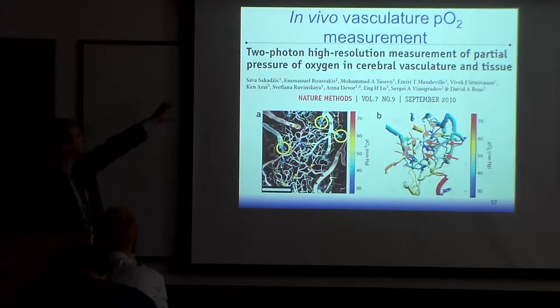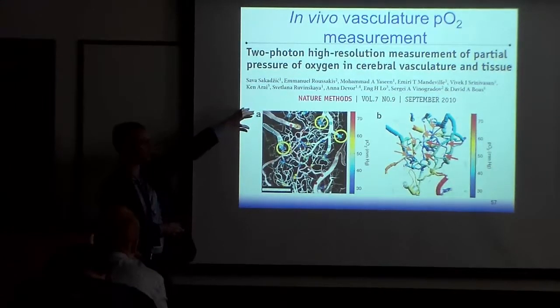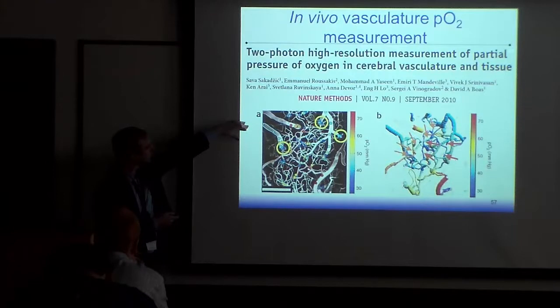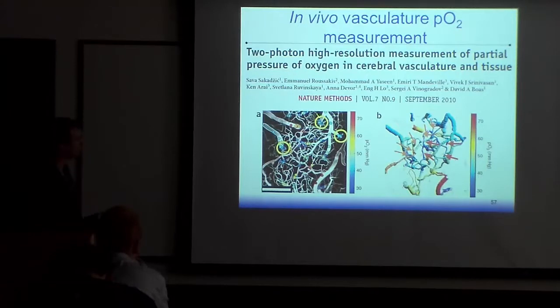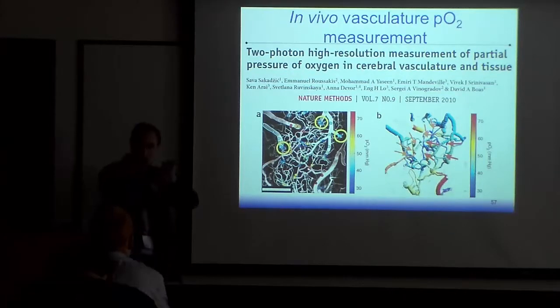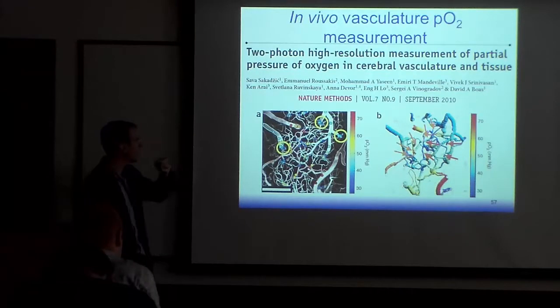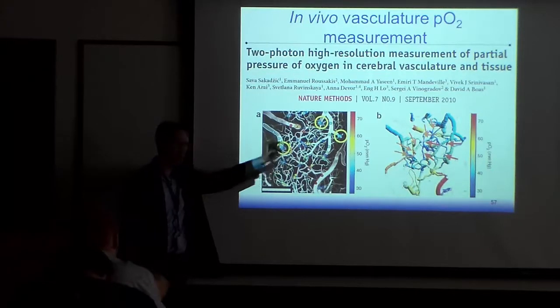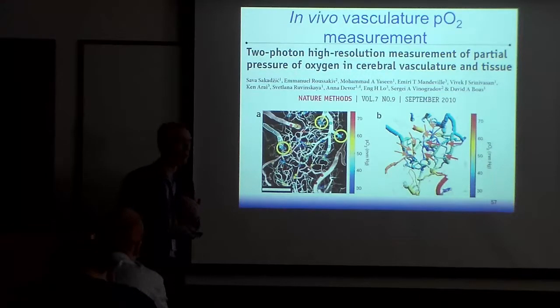Okay, so recently there's been some really great paper. So this is basically David Boas at Harvard did the imaging side of it, and Sergei Vinogradov over at University of Pennsylvania did the probe development. So they injected these probes into the mouse. They did 2-photon microscopy to get the same structures we were looking at earlier of the vasculature of the mouse. And then they said, okay, let's measure the oxygen concentration. So they move the laser to these specific points. They park it there, and they do these lifetime measurements. And then from there, they can measure, okay, I know what the oxygen levels are at each of these points. And then they can do a 3-dimensional mapping reconstruction of what it looks like.